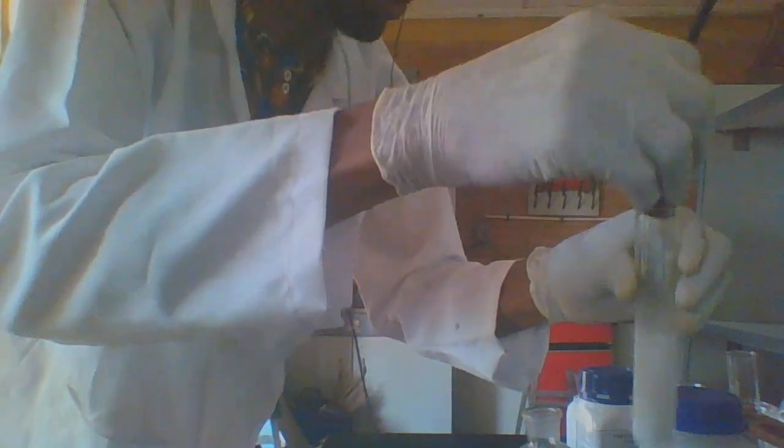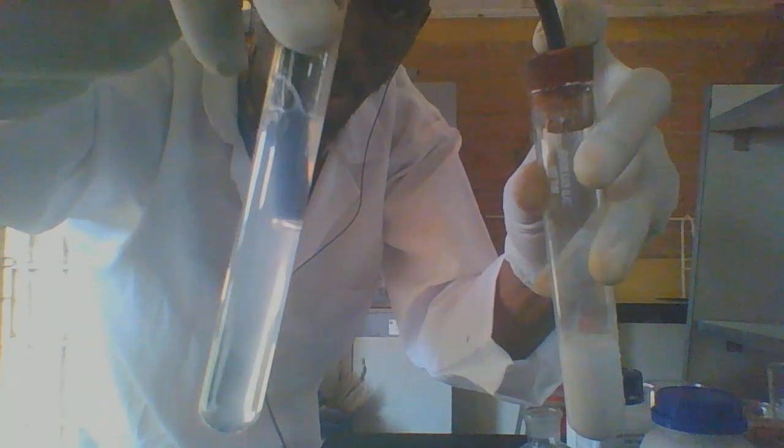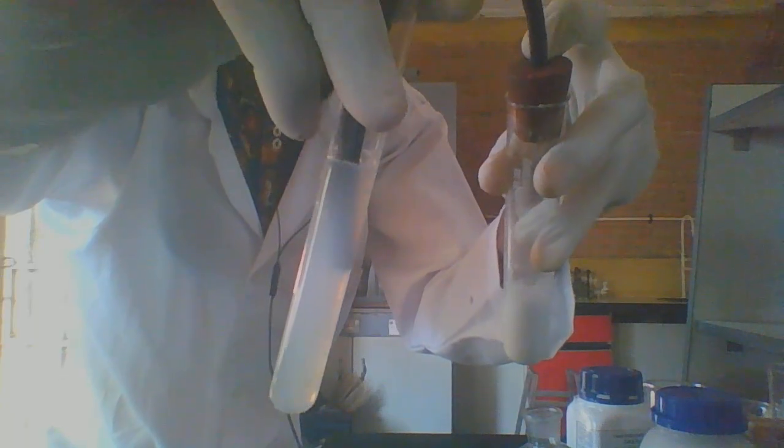So, adding the dilute nitric acid to this, you see effervescence. As the effervescence occurs, I pass the gas immediately through lime water. You see the lime water is turning milky. You can see it here, it's becoming cloudy. That is, it turns milky. What does that show us? It shows us that the gas is carbon dioxide from trioxocarbonate(IV) or hydrogen trioxocarbonate(IV).